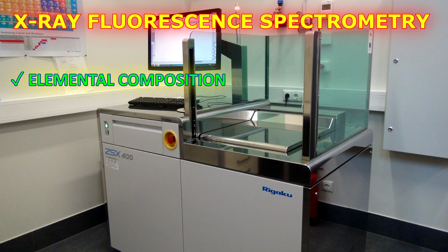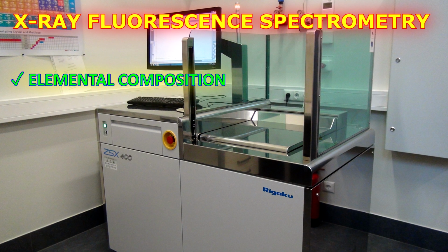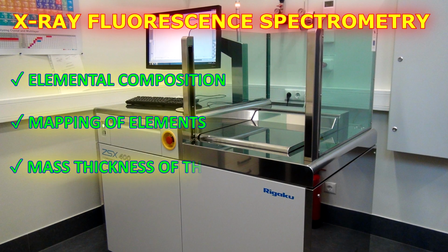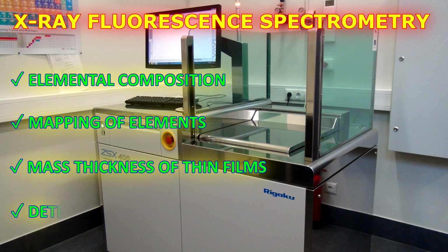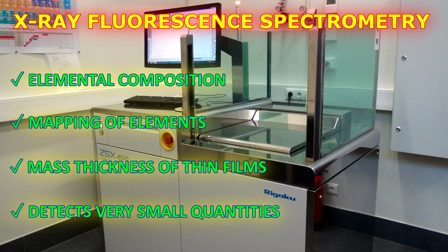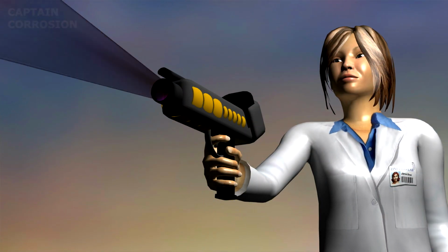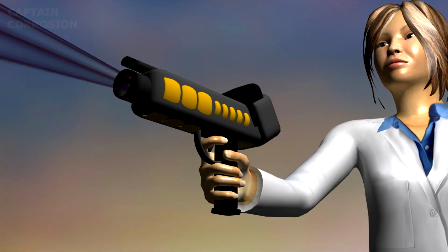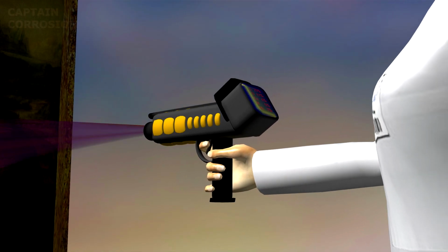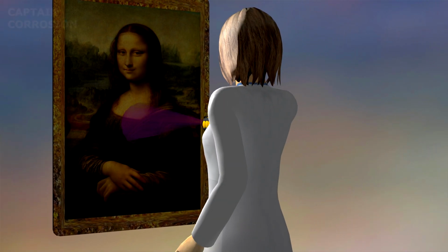Measuring the composition of a material, however, is just one option for this system. It can also be used to map the elements on a larger substrate, measure the mass thickness of thin films, or even detect very small amounts of unusual elements, which can be handy in analyzing crime scene evidences. There are also smaller, handheld versions of this spectrometer in the market. Although they are less accurate than their larger cousins, they are much cheaper and more comfortable for performing quick analysis.